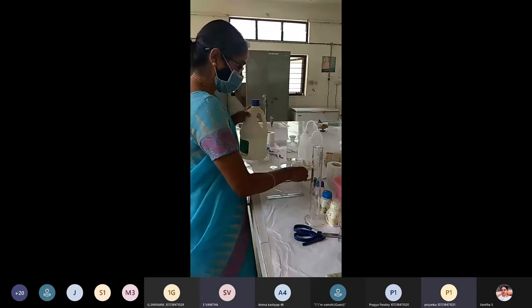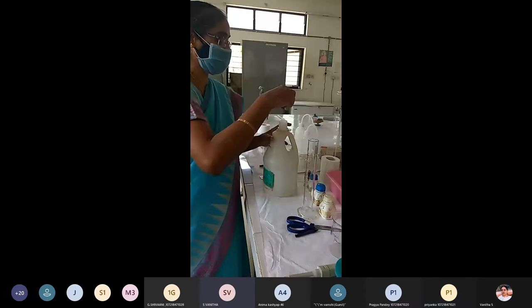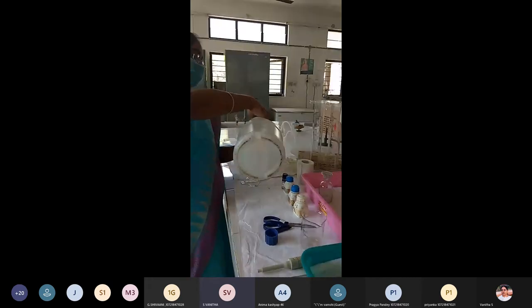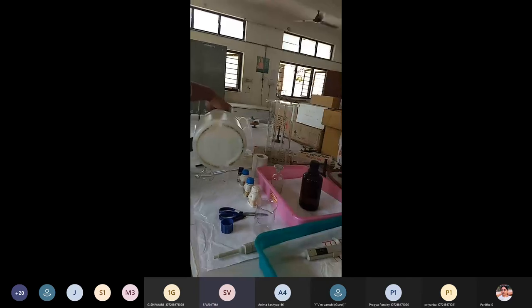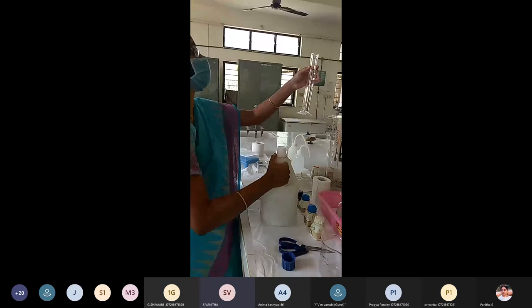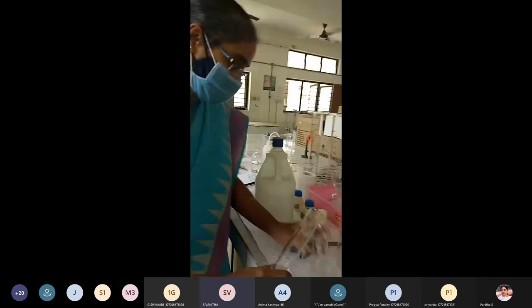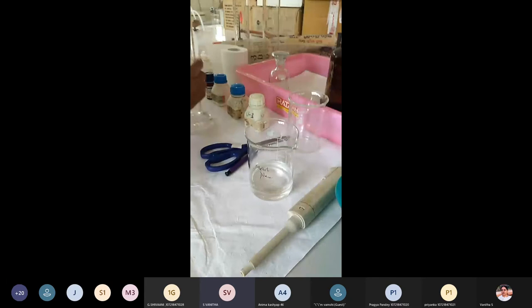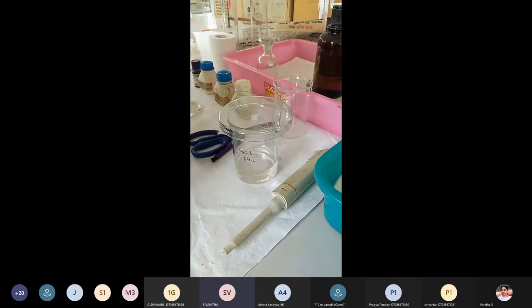Multiplying all volumes by 5 makes the preparation easy. The first component is isopropanol — transferring it into the beaker which will hold the mobile phase. Isopropanol is propan-2-ol, an organic solvent; keep the lid on so it does not evaporate. The second component is distilled water: 3.7 ml × 5 = 18 ml. Adding 18 ml of distilled water as the second component of the mobile phase.